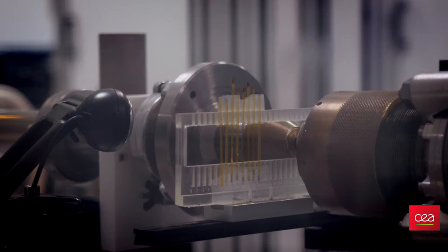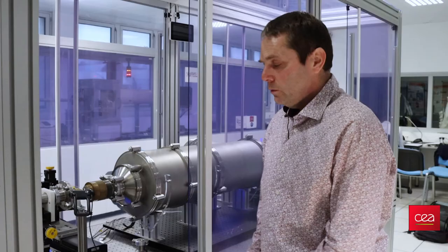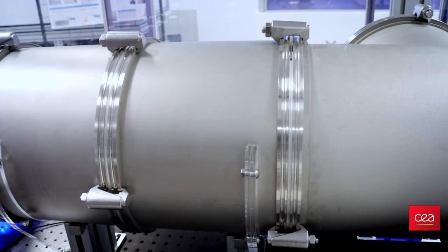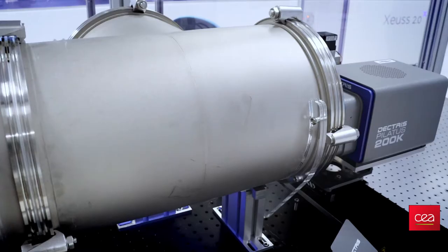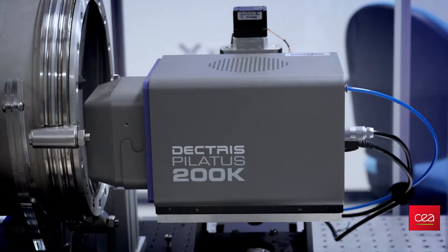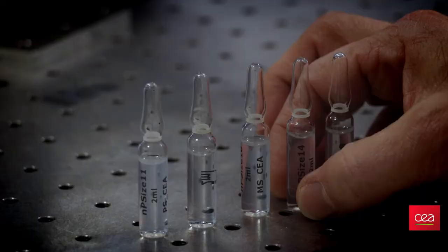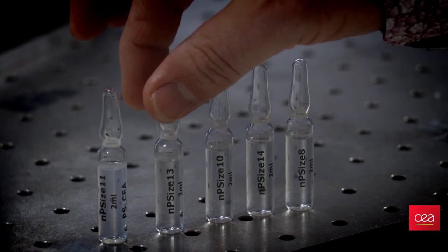The next parts of the instrument are very classical. On the sample array, we have a motorized positioning system. The vacuum chamber has a size of around 1 meter. At the end of the vacuum chamber, we place a motorized beam stop. And the detection system is based on a Dectris Pilatus detector. The q-range enables us to analyze nanoparticle diameter sizes from 1 to 100 nanometers with very good accuracy.